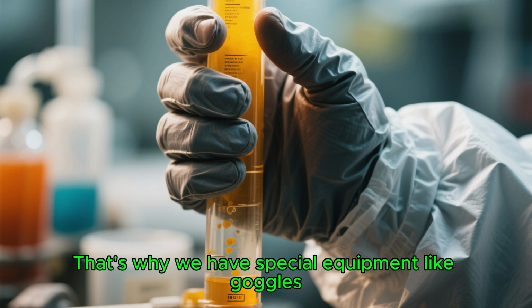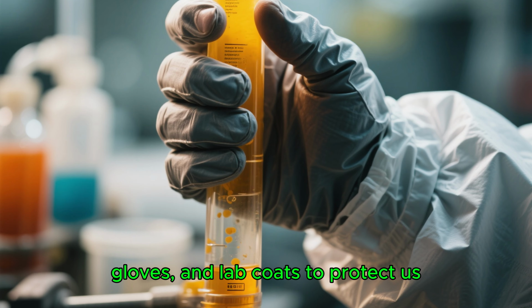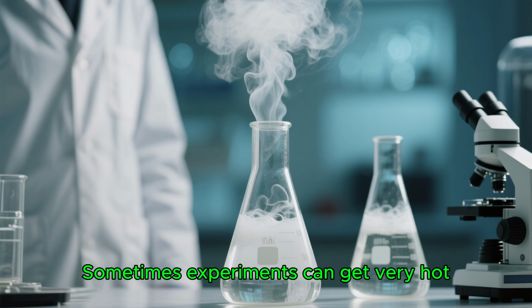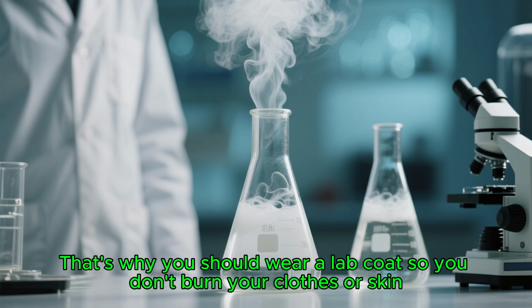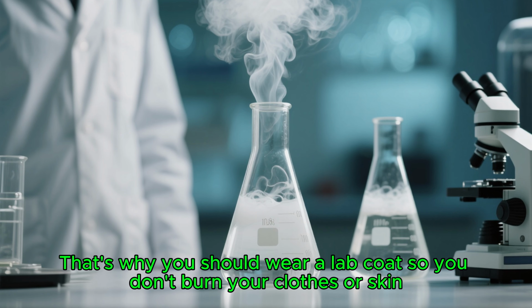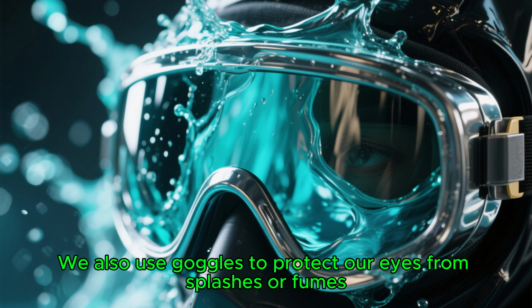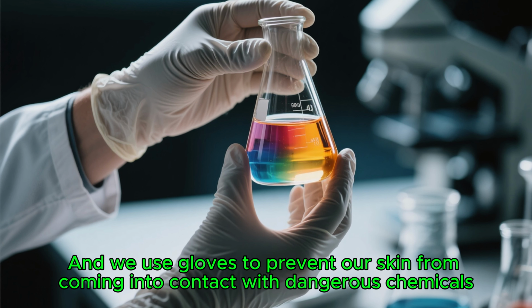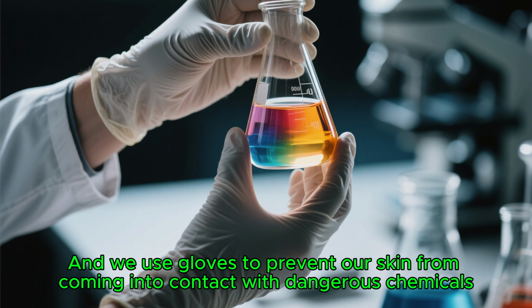That's why we have special equipment like goggles, gloves, and lab coats to protect us. Make sure to put them on before starting an experiment. Sometimes experiments can get very hot. That's why you should wear a lab coat so you don't burn your clothes or skin. We also use goggles to protect our eyes from splashes or fumes, and we use gloves to prevent our skin from coming into contact with dangerous chemicals.